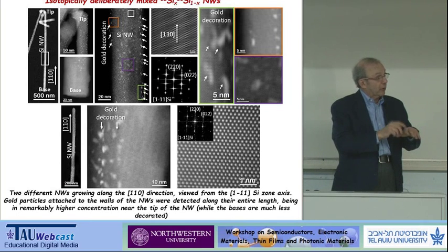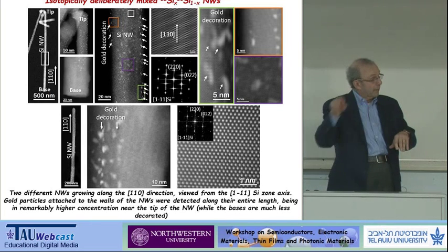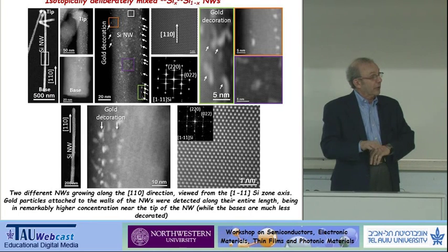And then you can take one of those same specimens, and this is tedious, and put it onto a silicon micropost for the atom probe tomography. This is really tedious.